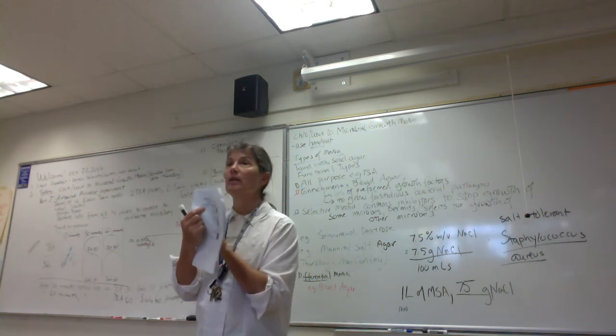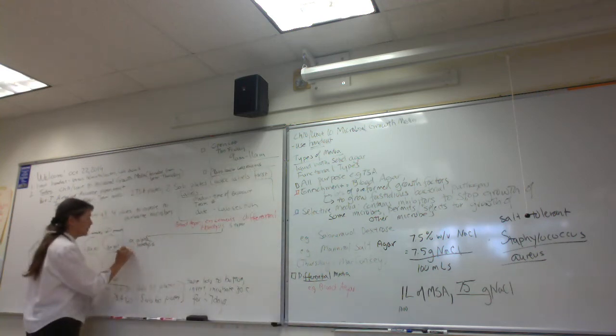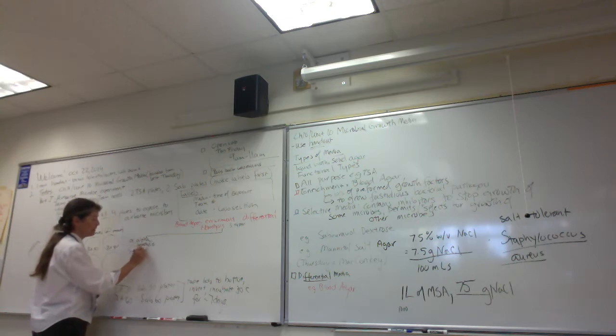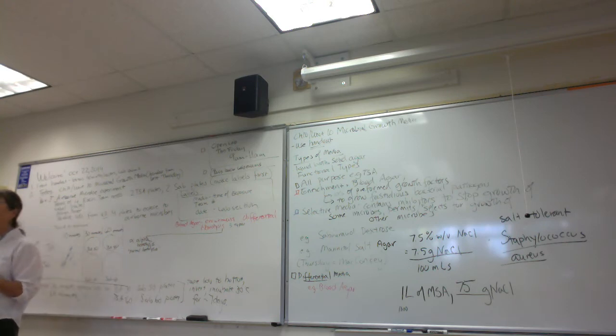Alpha hemolysis, right? And this is sometimes described as, it sounds kind of goofy, partial hemolysis. It's like, what do you mean by that? So Audrey has a really good description. Partial hemolysis, we're getting lysis of the red blood cells, but the contents are not being destroyed, and as a result, we get this greenish, dark discoloration of the agar surrounding the colony.